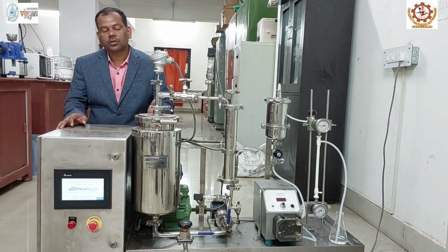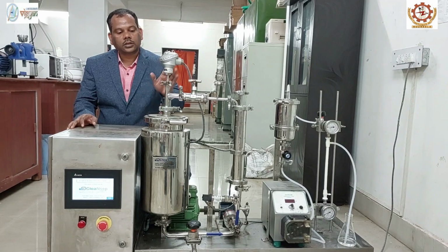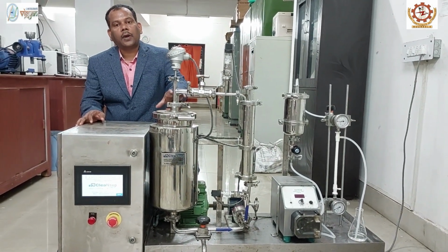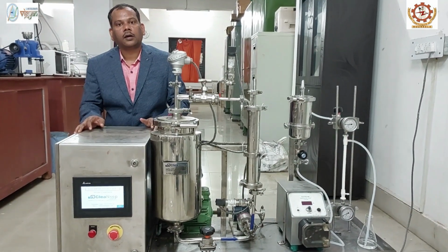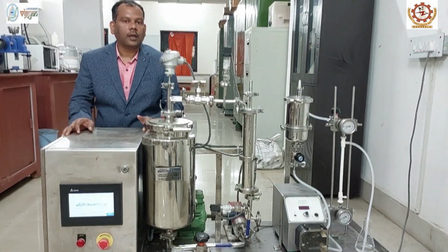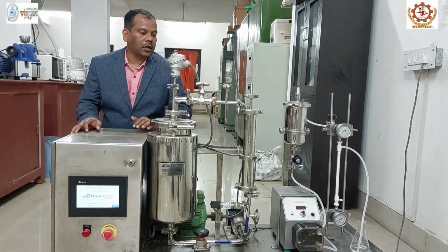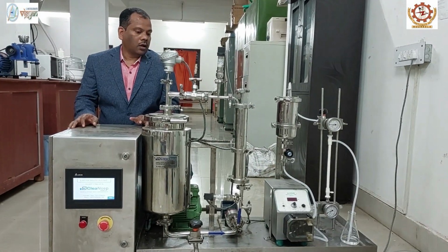To avoid those disadvantages, this membrane filtration technology can be adopted as an alternative to the thermal treatment. Various types of membrane can be used for fruit juice processing using this technology.